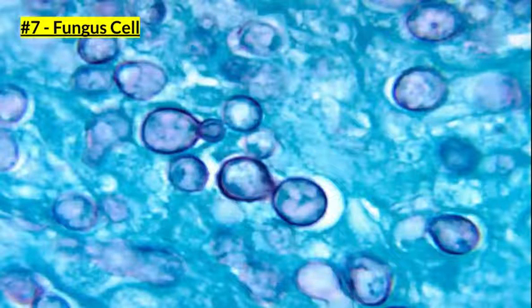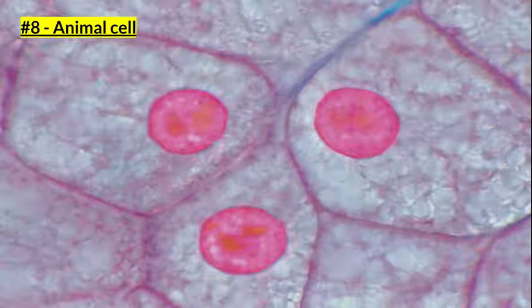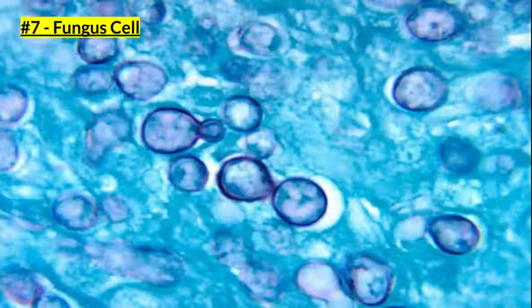But if you look at the difference between this one and this one, this is an animal cell, so I just tell you what it is because it's just a generic animal cell. The boundaries of the cells are different shapes. They look a little thinner. If you look over here, some of those cells have really thick coloring around them, and that's kind of indicating that there's more of a cell wall.